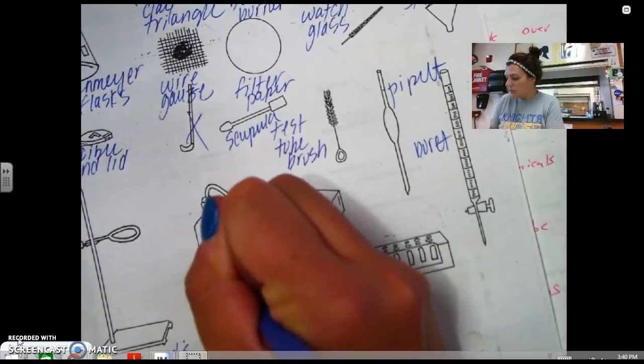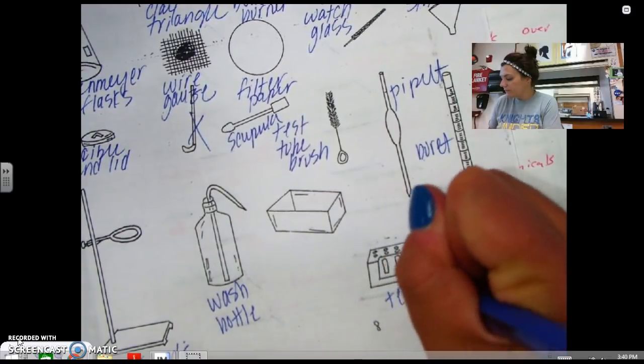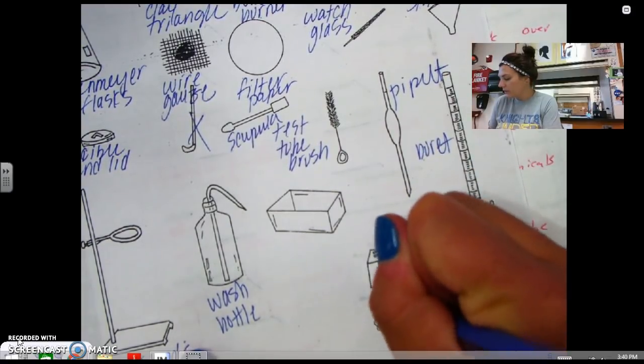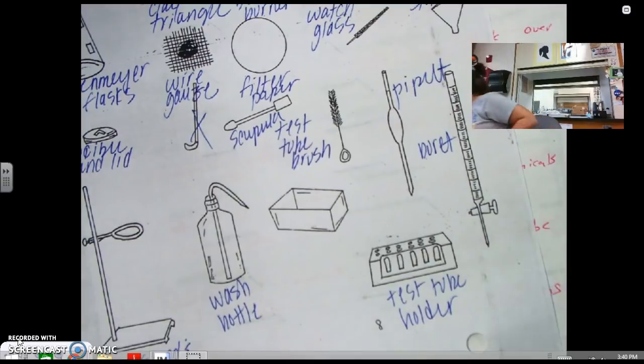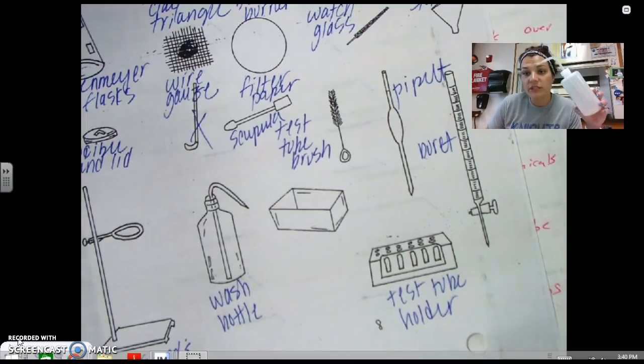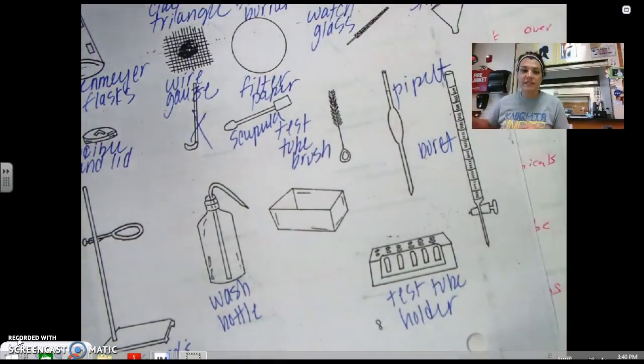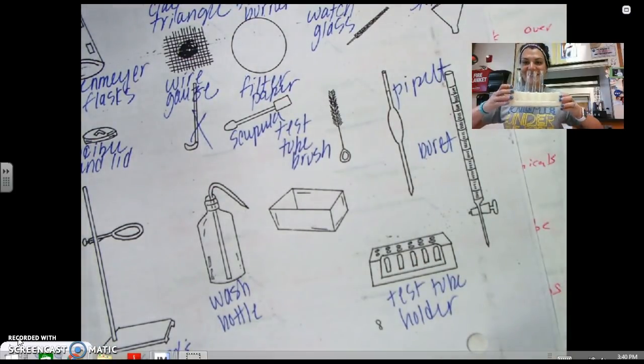the two last things. This is a wash bottle. Test tube holder. And I bet you could figure out what those things are. Wash bottles only ever have distilled water on them because we only in chemistry only deal with reactions with distilled water. And then our test tube holder obviously holds our test tubes.